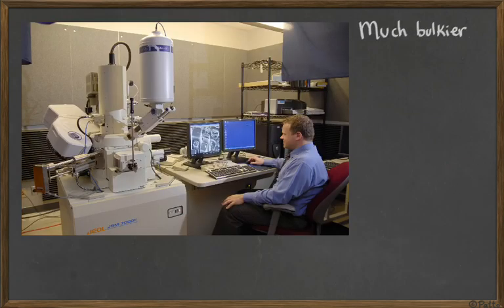The problem with electron microscopes, in addition to being black and white and only observing non-living material, is that they are much bulkier. While you can have an optical microscope that is small, the size of a small computer, and you put it on your desk and you can watch it, an electron microscope can occupy an entire room. It's much, much bulkier, much bigger, and it's very, very expensive. Usually it's so expensive that only universities or other research departments are capable of buying them. You cannot have an electron microscope in a school because they are very, very expensive.